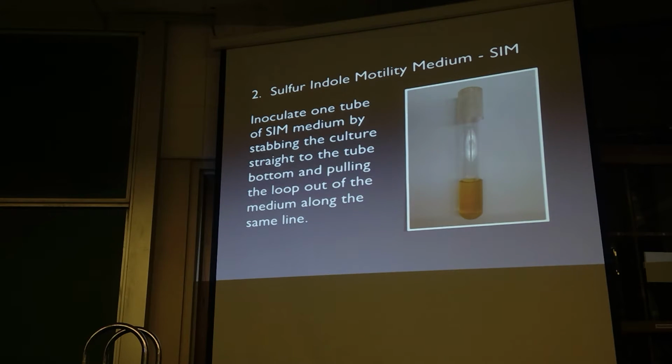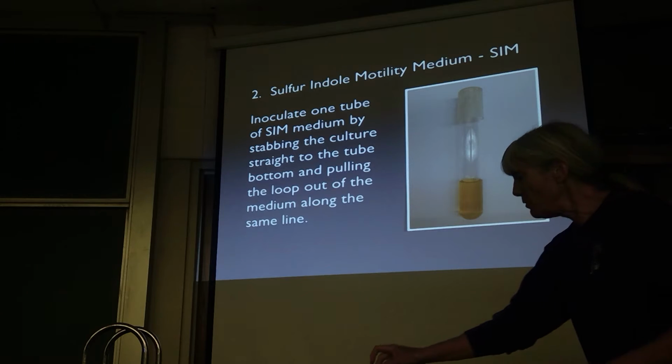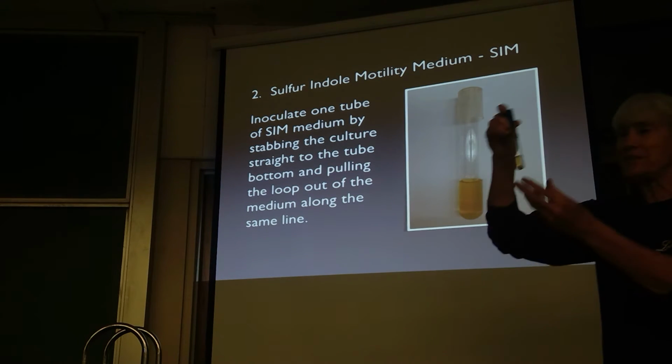Another medium type we're going to inoculate is called the SIM medium. SIM stands for sulfur indole motility. And if you really want to drive me nuts, refer to this as the SIM test. There is no such thing. This is sulfur indole motility medium. It's 3 tests in 1.